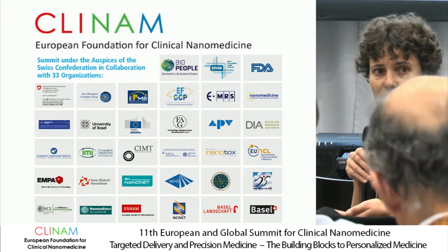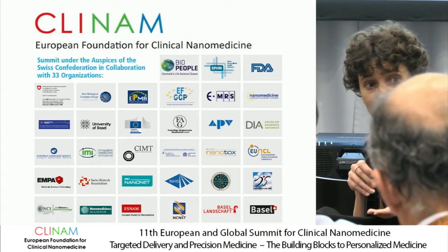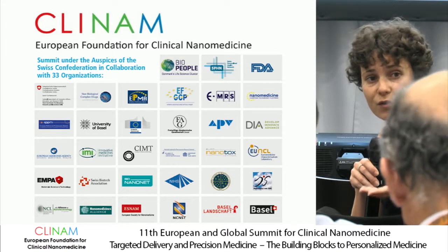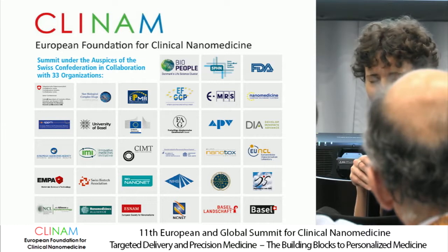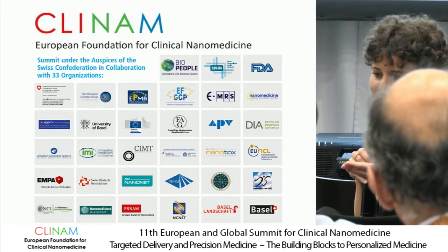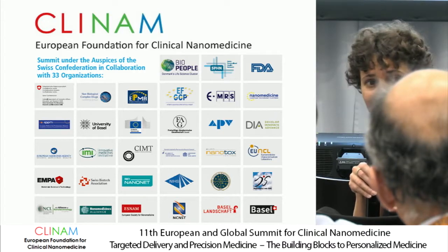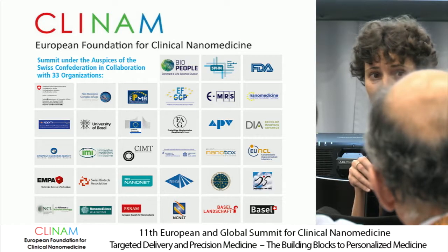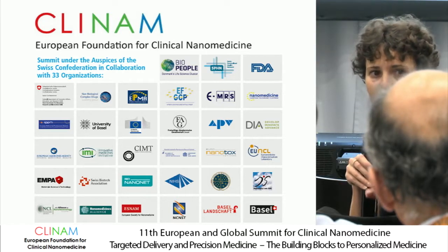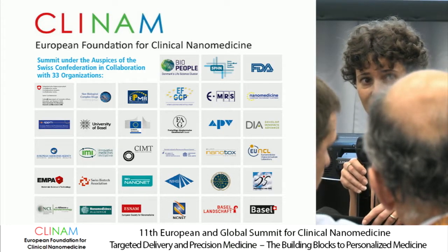This is why we always support the use of standard operating procedures, where, of course, these kinds of elements are explained. But unfortunately not everybody is using them or knows which are the important elements you need to do the measurement properly. So that's for sure something that we still encounter.